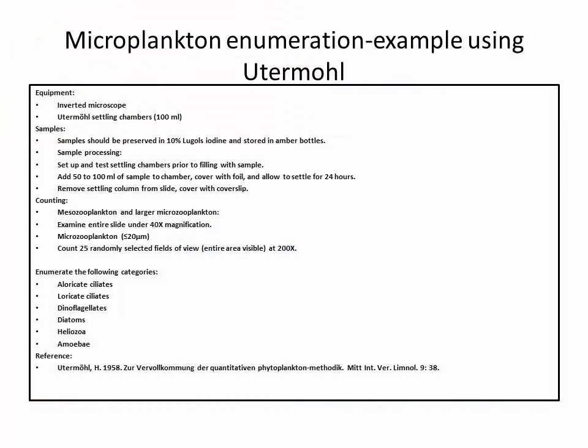This is out of a standard methods book that describes the Utermöhl method. Typically you use an inverted scope. A bit about samples: here they say 10% Lugol's, and so on and so forth. But you can use this for everything, you know, zooplankton as well as phytoplankton.